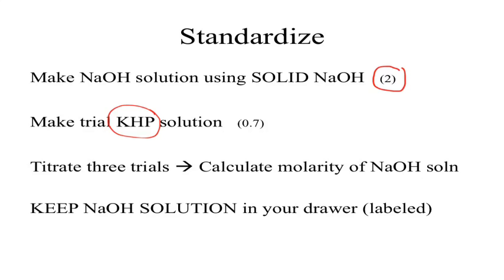Doesn't change the mole amount as drastically. So when we're going through to standardize a solution, we want to pick a standard acid or base that has a massive molecular weight. That way, if we do make mistakes in weighing it, those mistakes are minimized because the molecular weight is so large. When we're doing our titration, remember our endpoint is mole to mole. We don't care about the mass, it's all about those moles. So a small error in weight with a small molecular weight generates a relatively large mole error.